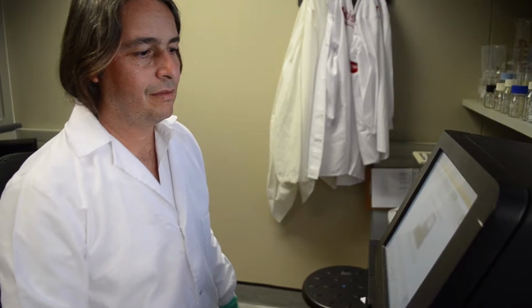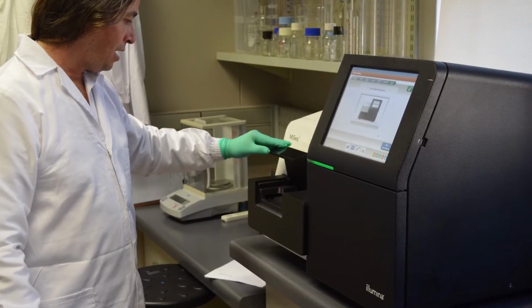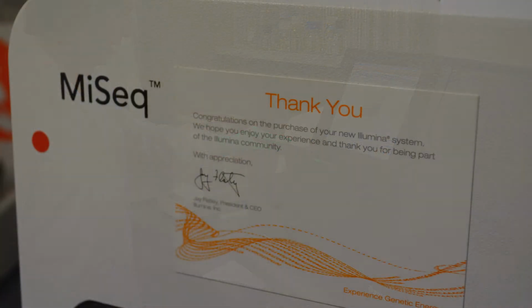So for example, we have generated thousands of whole genomes of HIV, also of hepatitis C, but we're also generating a lot of whole genomes from TB and drug resistant strains of tuberculosis, but also other bacteria. The Illumina platform that we have in our library is a MiSeq, which is very optimal to generate genomes of lower organisms, this means viruses and bacteria.